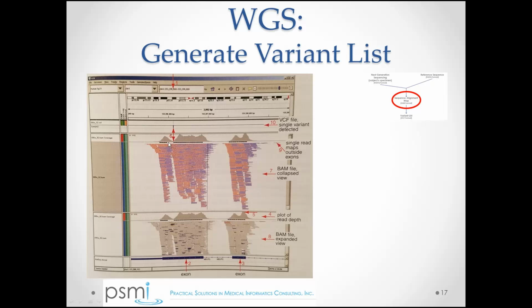I think it's actually kind of impressive when you think about the amount of data that's generated when you do a next generation sequencing run, and how the next generation sequencing run on one person can generate a terabyte of data. And when you begin to see, oh, okay, I get it now.